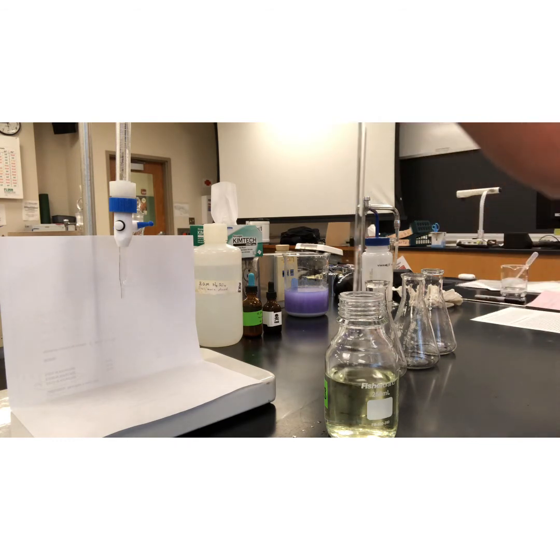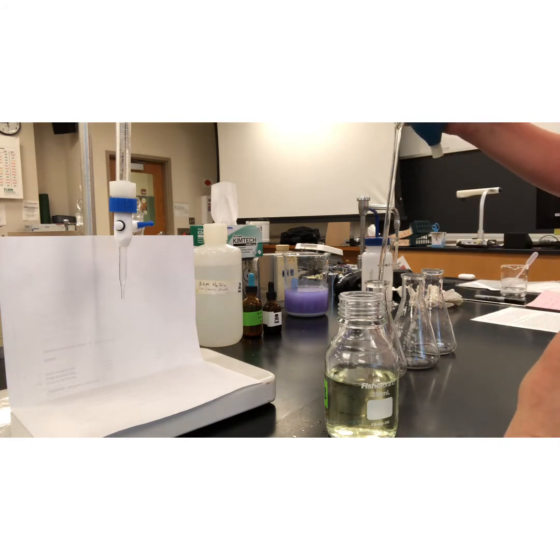All right, 25.00 milliliters even of my unknown. Going into sample container numero uno.